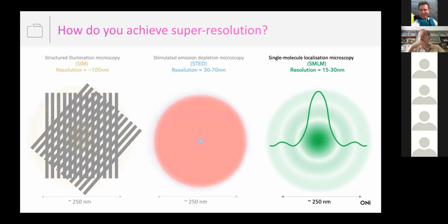And it basically forms the entire basis of how the nanoimager uses a combination of techniques to acquire a super resolution image. So for the rest of my talk, I'm going to focus on single molecule localization. Now, importantly though, this technique only works if it's possible to detect a single diffraction limited spot in isolation. And as we know, normally in your cells or your tissues, all the fluorophores from the labeling will be emitting light simultaneously once you turn on the laser.